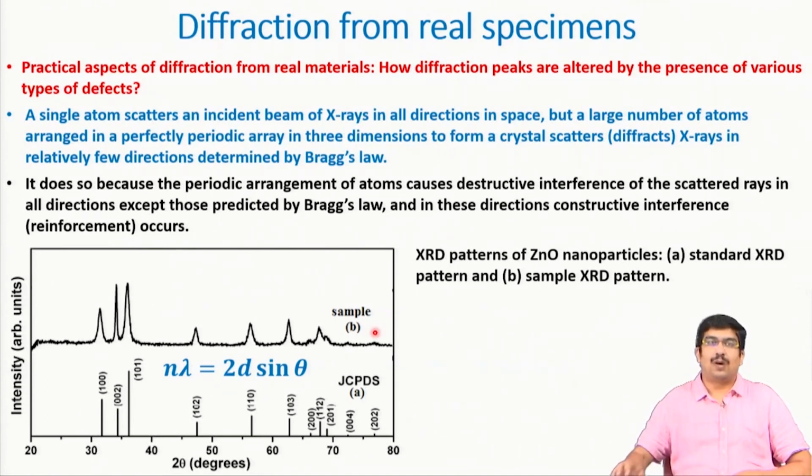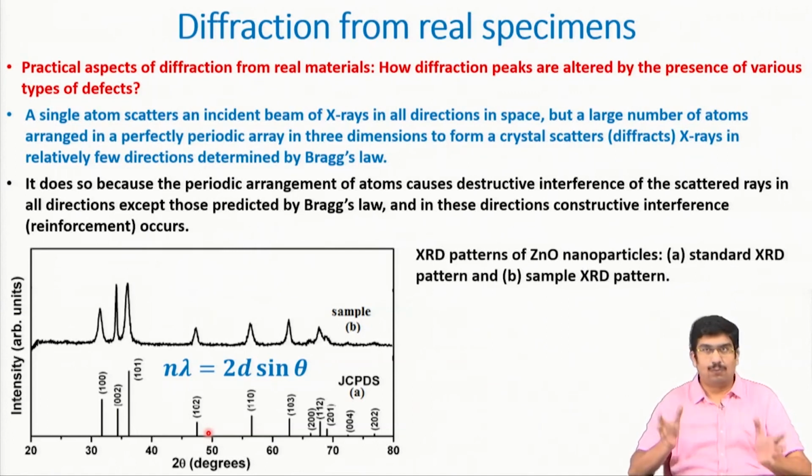We will try to understand what basically gives us this kind of an X-ray diffraction profile instead of this one. So, the intensity part, as I said, is mostly because of those factors we already discussed: temperature, absorption, polarization factor. All of these are related to modifying the intensity of this peak. That we will not discuss in great detail, but we will be discussing mostly this position, and why the finite thickness of the peak comes, because that will tell us more about this entire real specimen. That can help us to tell more about the specimen itself.